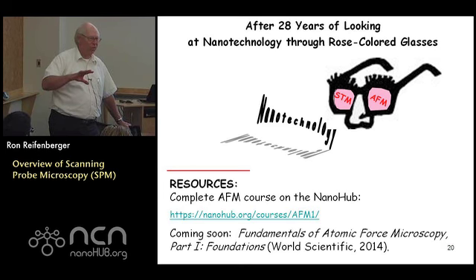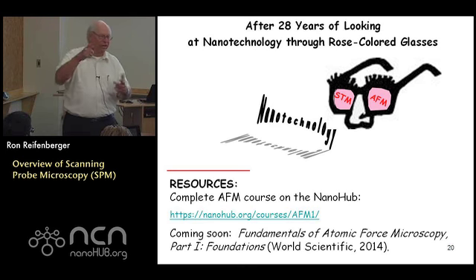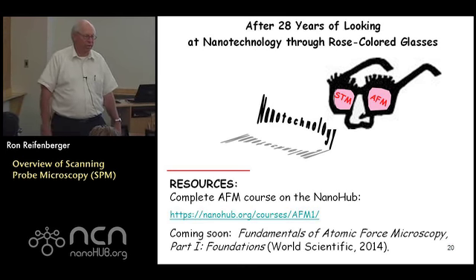Most engineers, all they want to do is measure the depth of a trench or the width of a trench or the height of a plateau, and that's in hundreds of nanometers. That's not a problem, right? But the really scientific work where you're trying to push atomic resolution, there's maybe only a dozen or so labs in the world that are good enough to play in that sandbox.